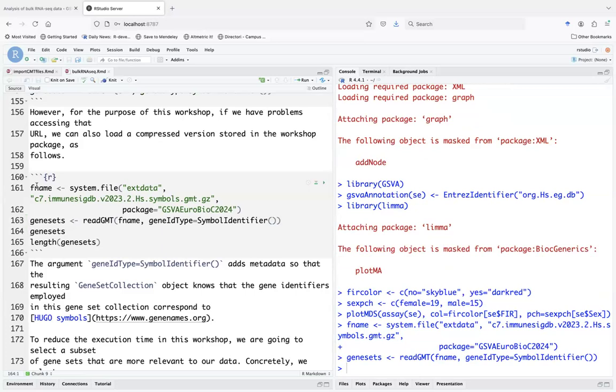I have a question here. Sure. Is there any reason why a log CPM was used for normalizing the data? Yeah, but this is part of the standard, let's say, limma pipeline. We use limma for analyzing. There is a publication on this data, and we use limma. Limma-voom, you know, or you can use linear models, and you have your matrix of expression, which are continuous, and you have your matrix of precision weights for the variance, and then you can use linear models to analyze this data. It's quite a standard thing.